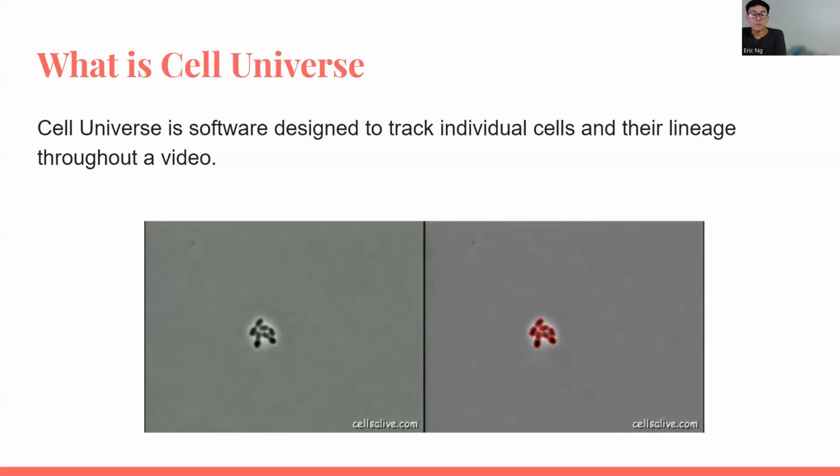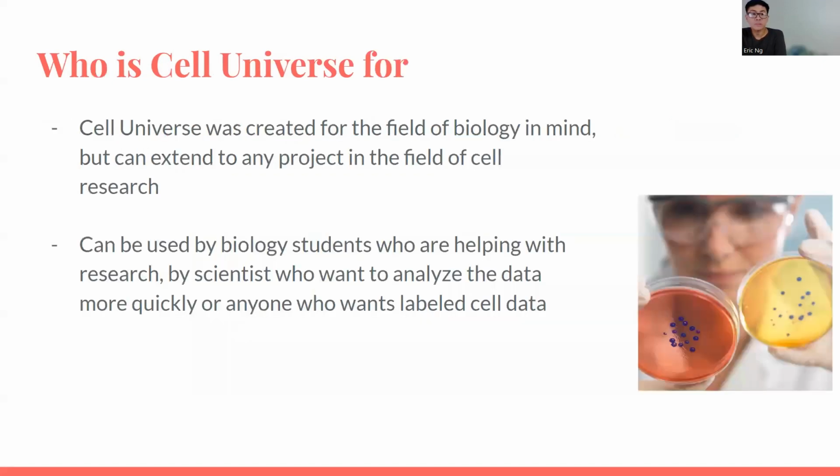And here we enter what is Cell Universe. Well, Cell Universe is a software designed to track these individual cells and their lineage throughout a video. So if you can see on the bottom, here's an example of the video of a cell splitting and moving around, and you can see how Cell Universe is trying to track those cells.